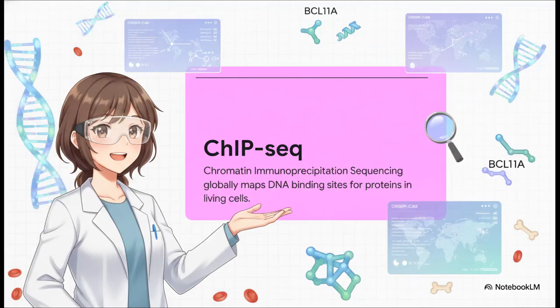And the answer to that massive question is a revolutionary technique called ChIP-seq, which stands for chromatin immunoprecipitation sequencing. Now, you can think of ChIP-seq as a kind of molecular GPS tracker for our DNA. It profiles transcription factor binding events across the entire genome, answering that one absolutely crucial question: where exactly does a specific protein, in our case, the master regulator BCL11A, physically attach to our DNA to regulate genes in living cells?